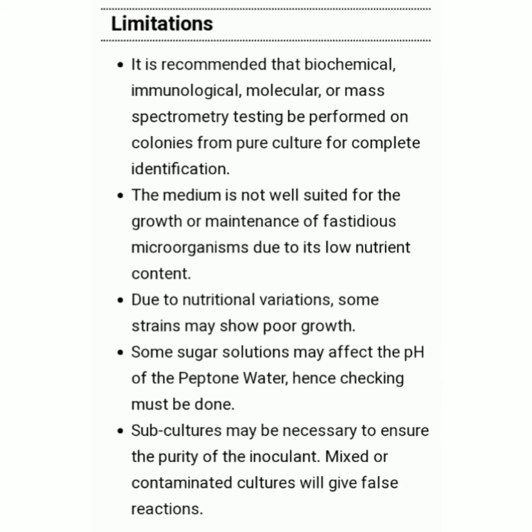Some sugar solutions may affect the pH of peptone water, hence checking must be done. Another point is that subcultures may be necessary to ensure the purity of the inoculant, because mixed or contaminated cultures may also give you a false reaction.